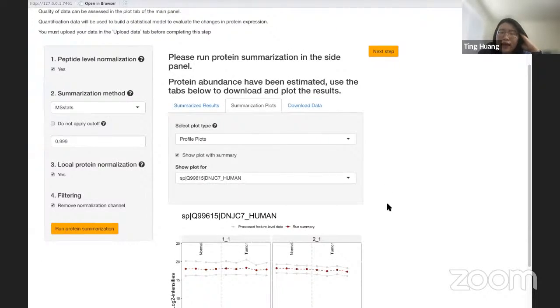So that's why we have another type of adjustment method, which is FDR based, the Benjamini-Hochberg one. Actually, in MSstats and MSstatsTMT, what we use is just the Benjamini-Hochberg one. So compared with Bonferroni, we use Benjamini-Hochberg as the default multiple testing adjustment method in MSstats and MSstatsTMT.